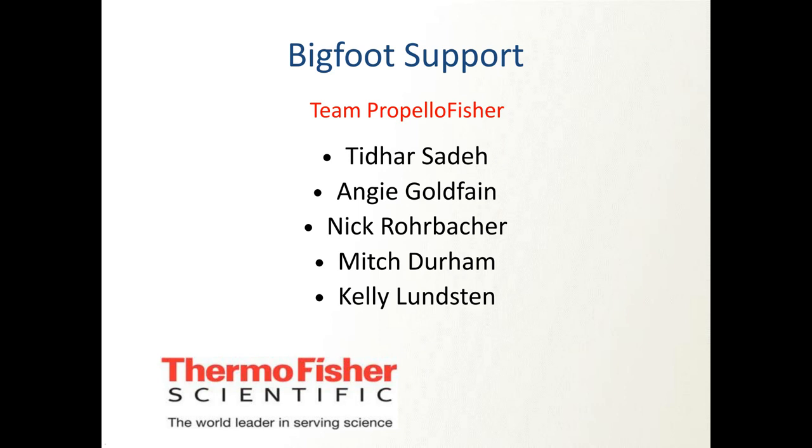I mean, no one can deny beads are the way easier control. They're bright and they'll do whatever antibody. The use of a biological control isn't always possible. Some epitopes just aren't expressed at high enough level to give you a good unmixing. They're going to be either too few or too bright at the higher levels. And you can't just swap reagents, because the tandems aren't exactly the same. And that really becomes obvious in spectral space.